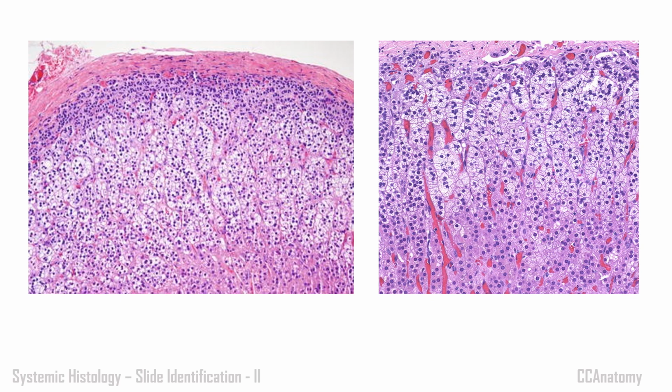So this is the last slide. It is a bit tricky slide. Here you can appreciate this as glandular, because of the multiple epithelium. Some kind of gland you can see. If you closely observe its outer side, in its outer surface the glands are arranged in some kind of circular fashion, kind of glomeruli.